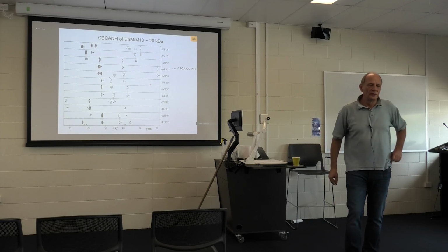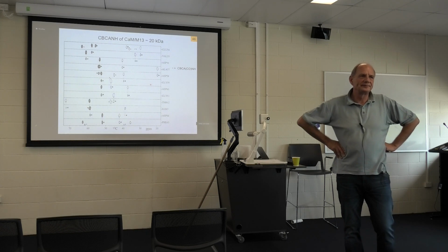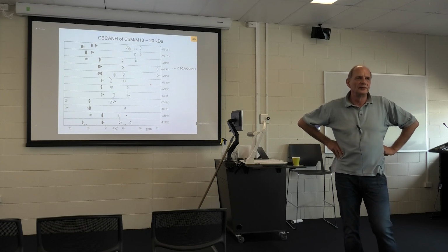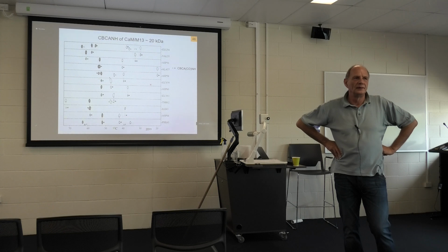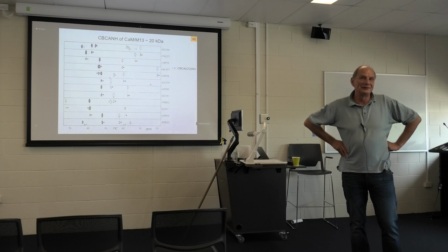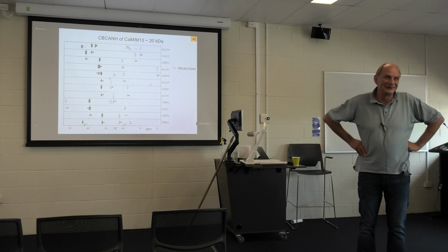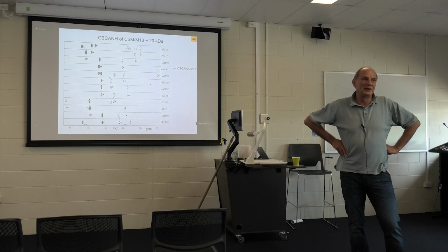Yes. With the whole secondary chemical shifts and another 30 years of data under the belt, are there any updates where those isosurfaces or probabilities have been refined? No, I never found the time to get somebody interested to do it, but it would be pretty easy.